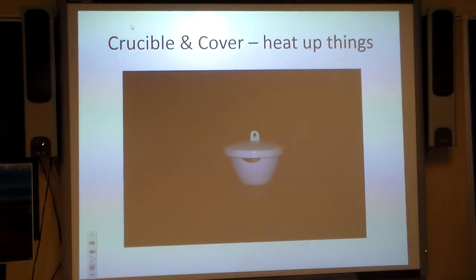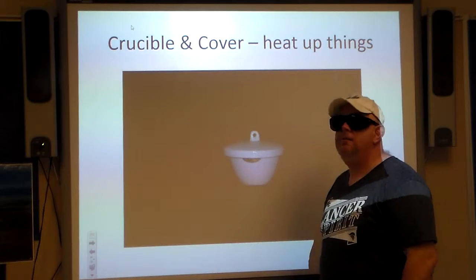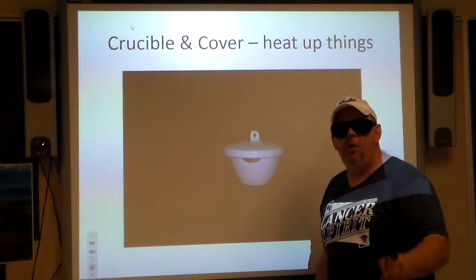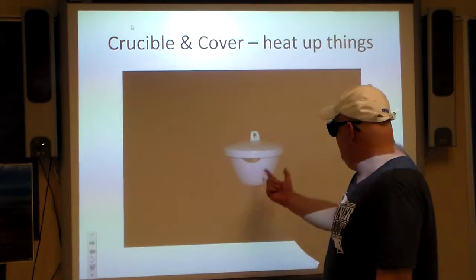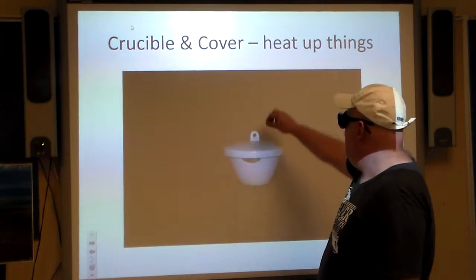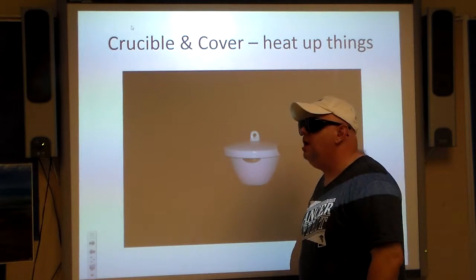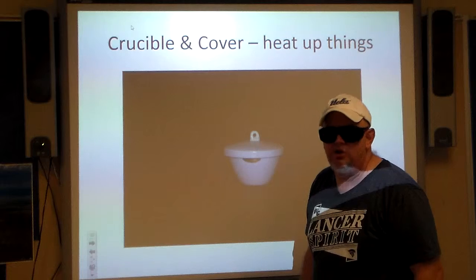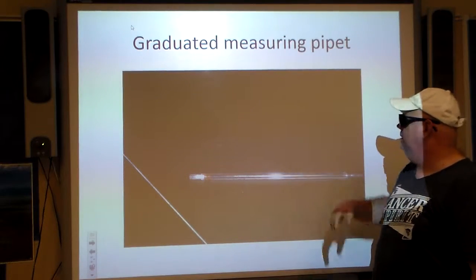Crucible and cover — you get to heat up things in there too, and again it's made of the same porcelain. They make some in China and also here in the United States by a company called Coors — yes, the same company that makes beer, but they also make crucibles. This one has a lid so whatever you heat up, you close the cover. When this thing is heated up, do not touch it with your bare fingers — that would not be a good choice. That's what crucible tongs are for.